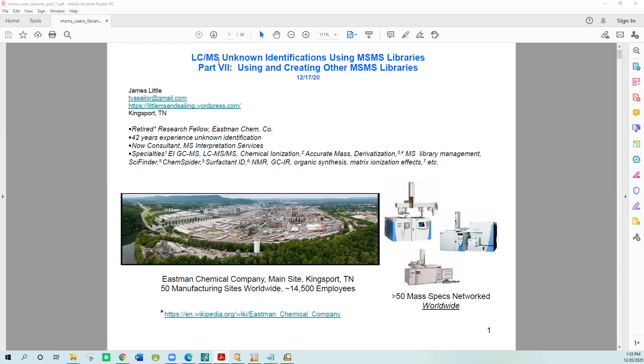I've already created a session on EI and unknown identification using the NIST libraries and NIST search, but I feel like the use of MSMS libraries is greatly underutilized compared to EI type searches. I think it can be very valuable in unknown identification, so I wanted to go through the software to encourage people to take advantage of this powerful technique.